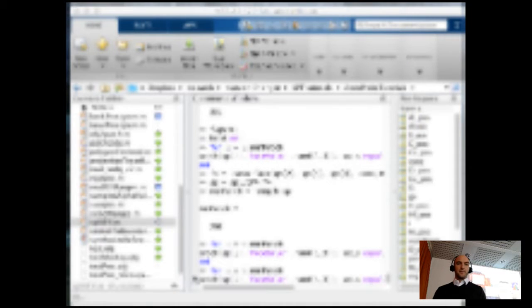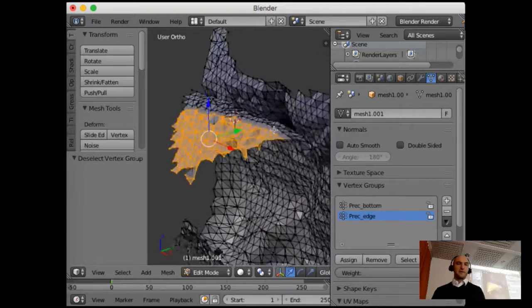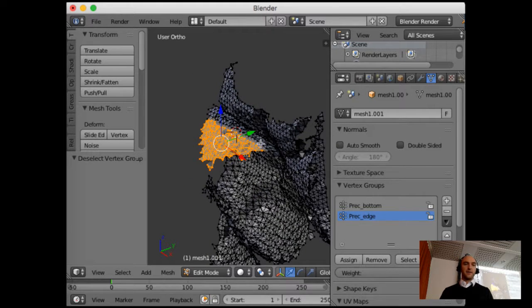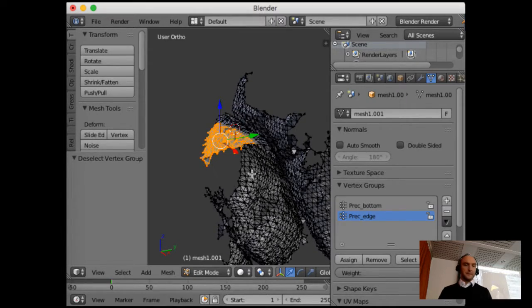It's not usually a problem because you don't want to analyze overlapping regions anyway. You want to analyze the edge versus the flat part of a precipitate, for example. If you're doing superalloys, it's a task we've been seeing a couple of times. So far, you would put in analysis cylinders and play around with that, which is pretty annoying. It's just much nicer if you have an analysis file and you can mark certain areas and do analysis locally.